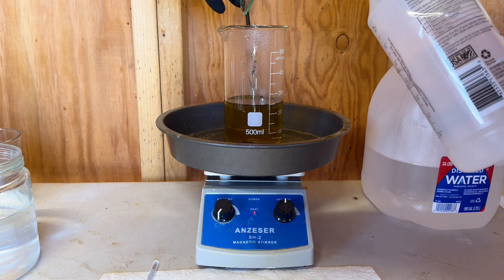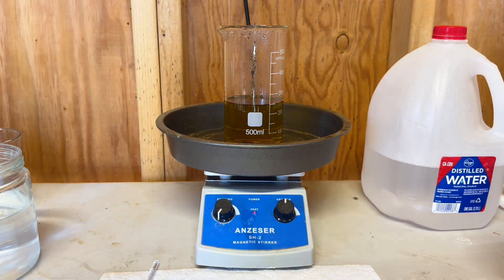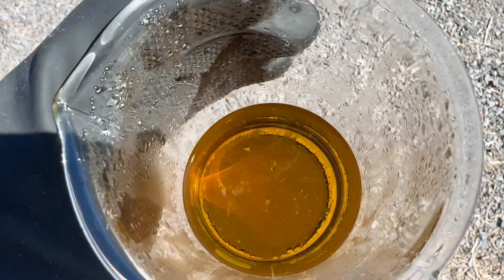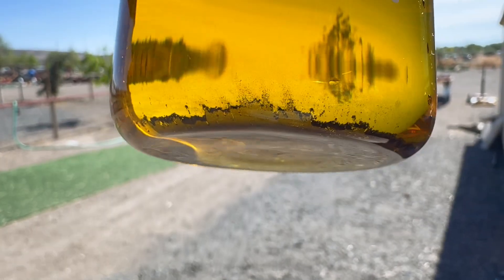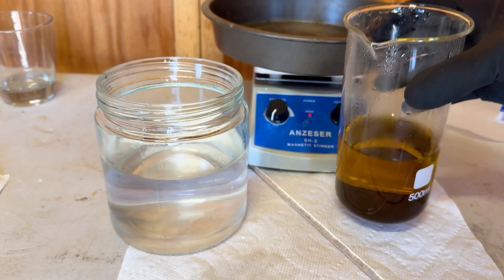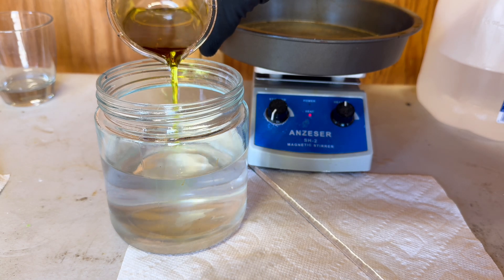It is now 9:30 a.m. the following day and our solution has sat overnight for 14 hours. Now we are going to remove the aqua regia and get to our gold drop. You can see our gold drop on the bottom of the beaker. We are now going to pour out our aqua regia and we will give our gold drop a good rinse in some distilled water.